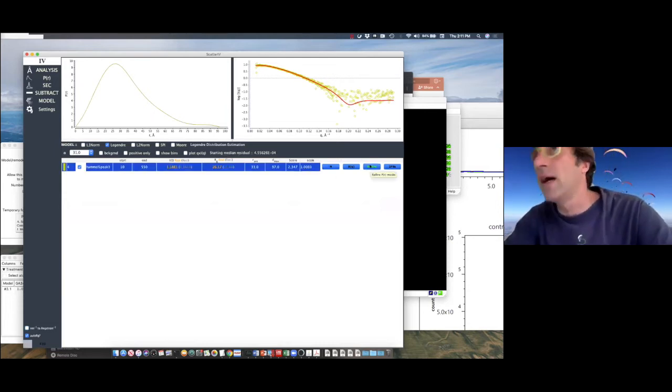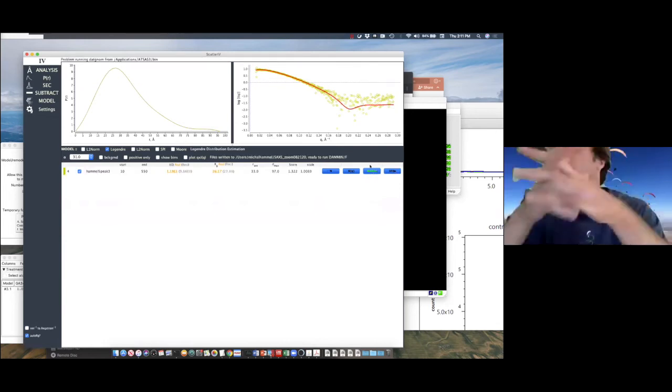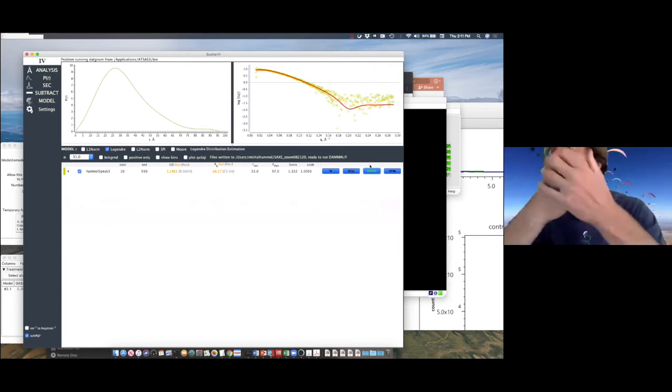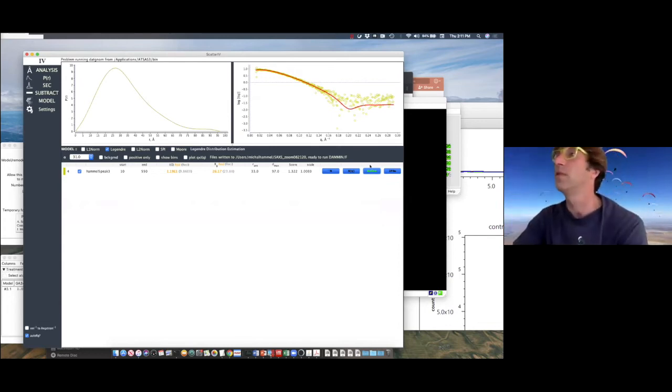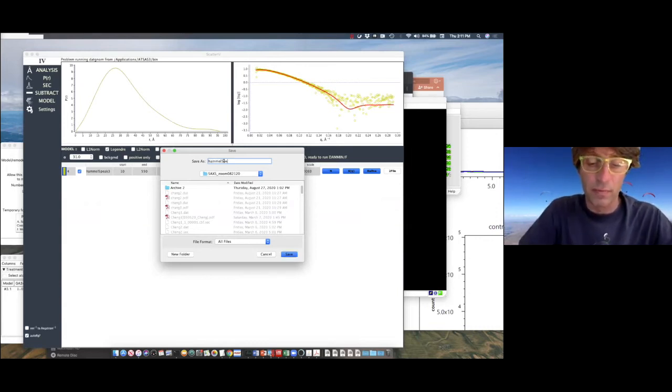And when you refine it, somehow, magically, the scatter produces the GNOM output file. Great. It took me a long time, and there was a discussion before that. Maybe Rob doesn't know that, but when you hit refine, the GNOM output file is produced. That's good news. I think it also works with the new version of Scatter 4. It also works when you type to file, and you just type the name, and let's say this is Hammel 5p3 PRR function, and save it.